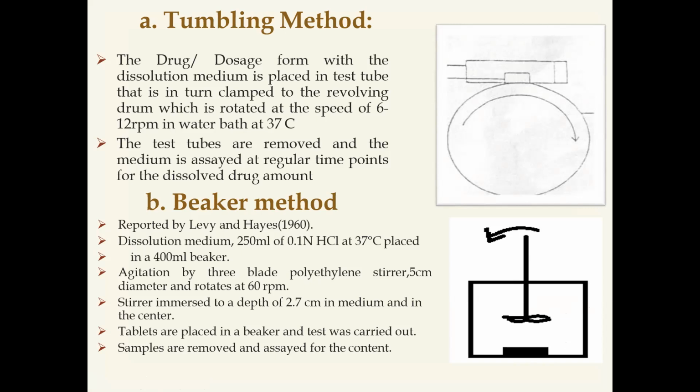And here they are maintaining some conditions. The stirrer is immersed in a depth of 2.7 centimeter in the medium. Also, this stirrer is kept at the center of the beaker.